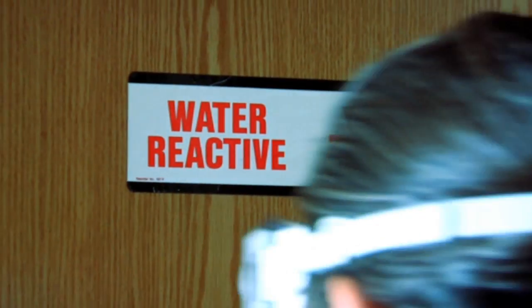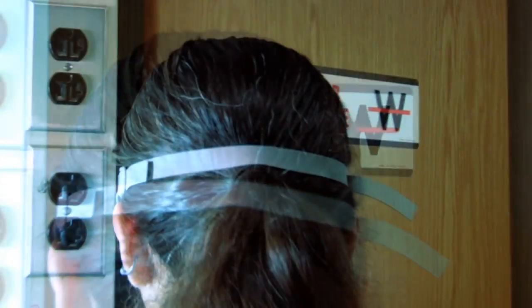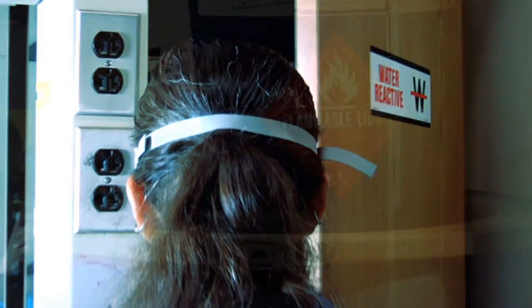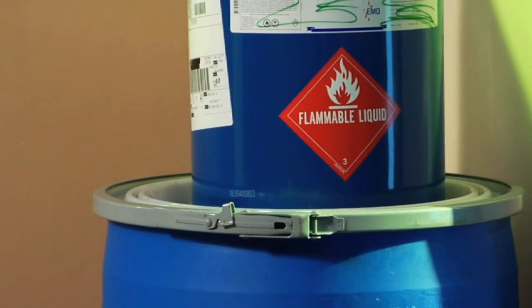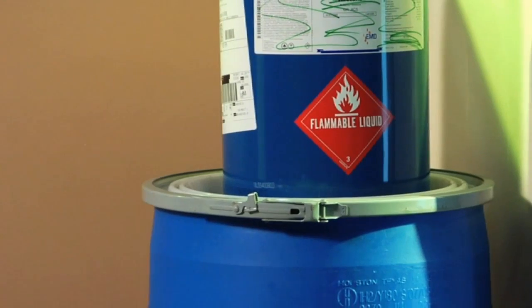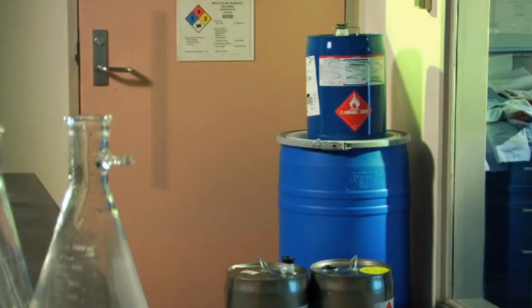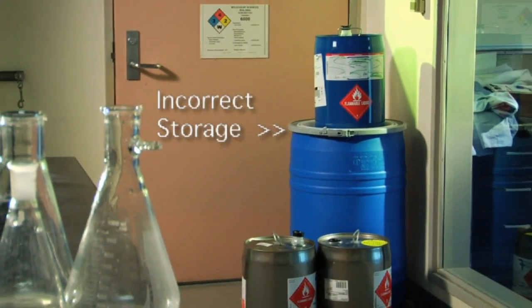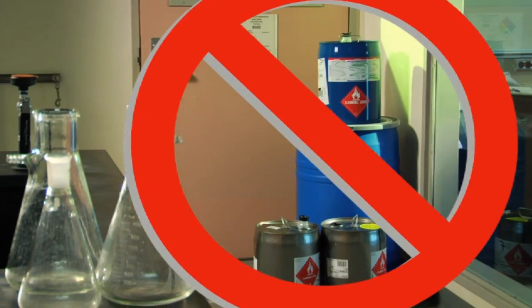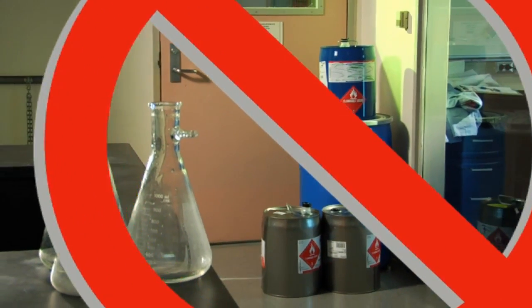Store water-reactive and pyrophoric chemicals separately in approved and labeled cabinets. At any given time, no more than 10 gallons of flammable and or combustible liquids may be kept outside of the storage cabinets in laboratory areas. The vapor content in flammable material containers may still pose a potential hazard. Therefore, properly dispose of all empty or unnecessary containers in the lab.